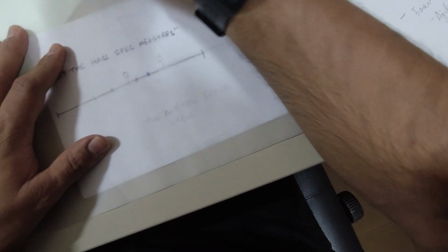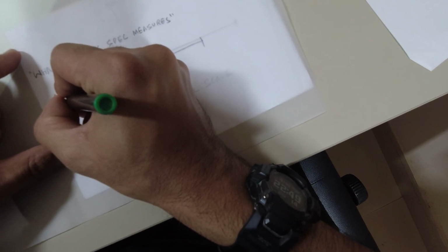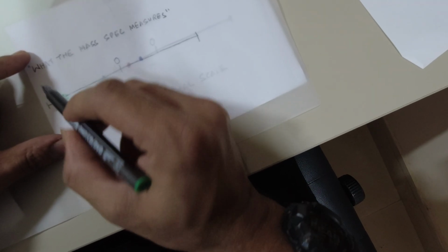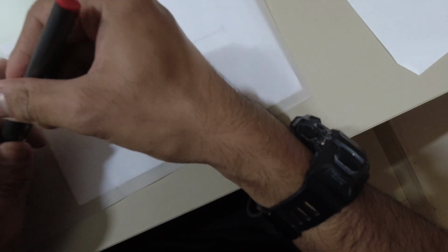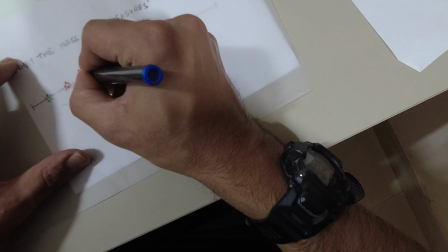So let's say for the green standard, I'm going to get like 3 values for that. I'll just draw a cluster of 5 or 6 green dots over there. Then a very quick cluster of a few red dots, and then a very quick cluster of a few blue dots. And then the software is going to calculate a central value.